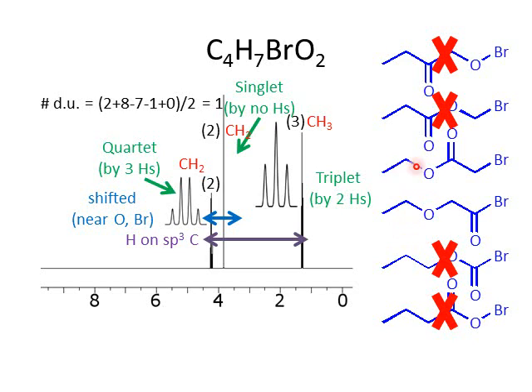In both cases, I've got an ethoxy, and so that seems very consistent with this and this. This CH2, well, it's either in this molecule or this molecule. In this molecule, it's between a bromine and a carbonyl. In this molecule, it's next to an oxygen and a carbonyl.